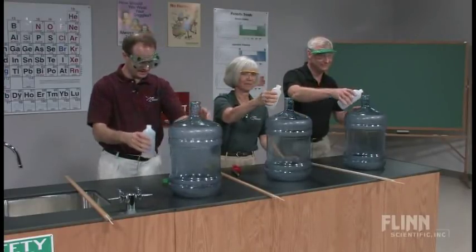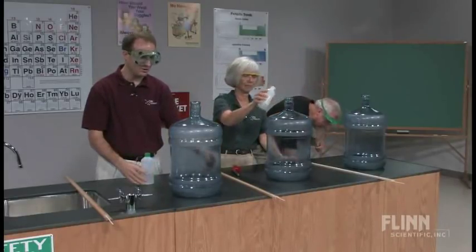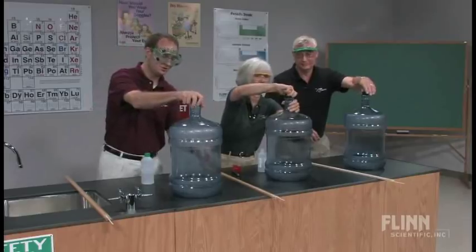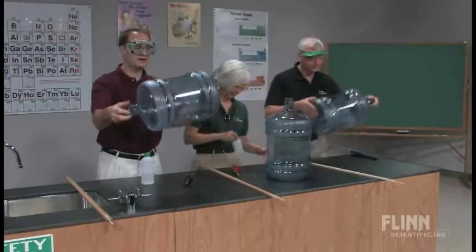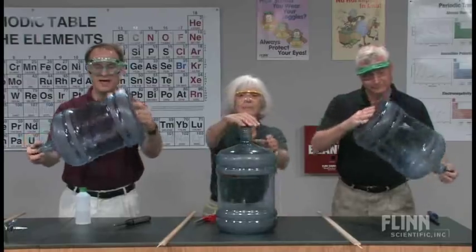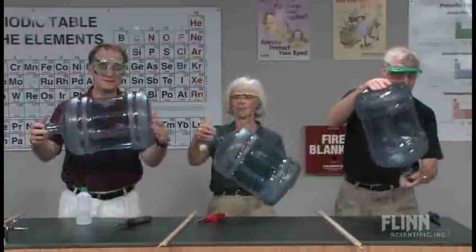If there is a danger in this demonstration, it would be not using enough alcohol, because it's important to make sure that you have more than enough alcohol so that oxygen is the limiting factor. Because we want a burn, not an explosion.